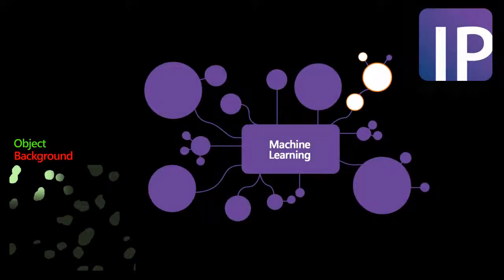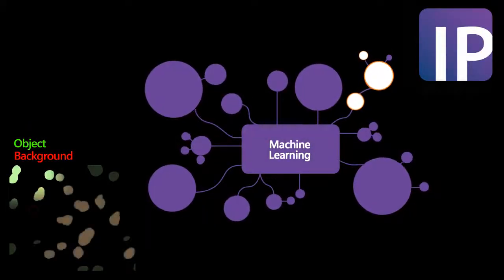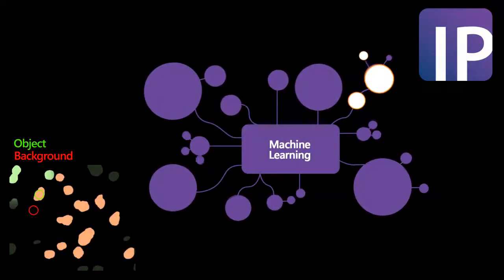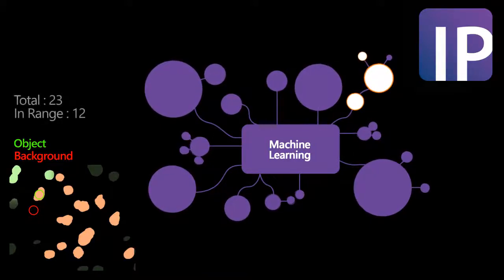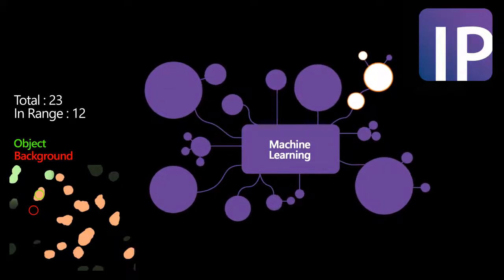Smart Segmentation is also a trainable learning algorithm that can be easily refined with successive images by simply selecting additional areas of interest for the objects or the background. While training across additional images, ImagePro maintains a running total of all objects, so it is clear how the changes will impact the final results.